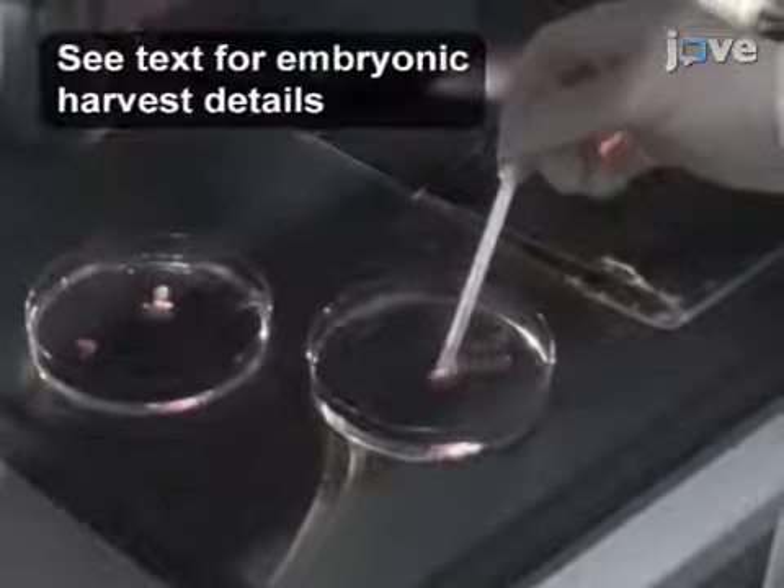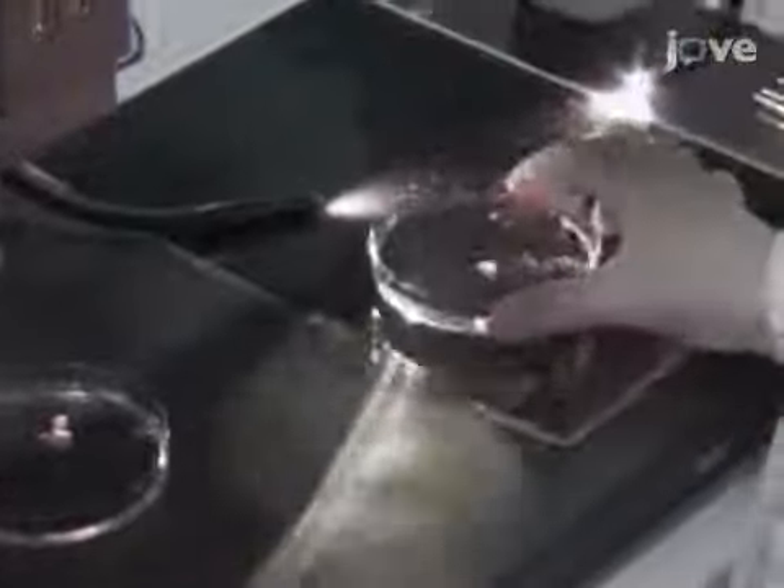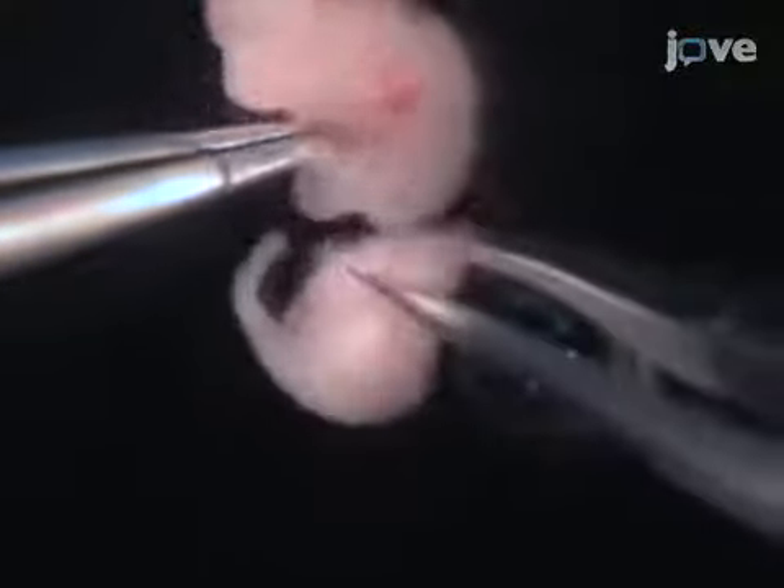When the tips are ready, place an embryonic day 11.5 embryo in PBS under a dissecting microscope. Use a fresh dish for each embryo and, with number 5 watchmaker forceps, cut the embryo directly under the forelegs.